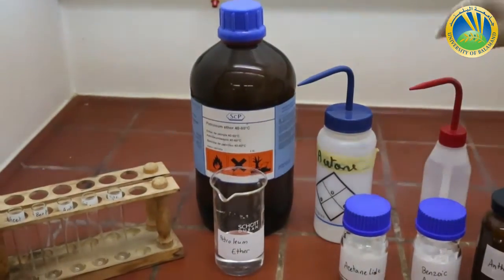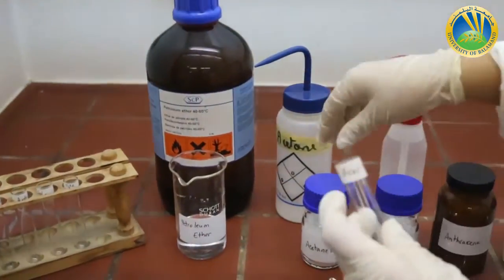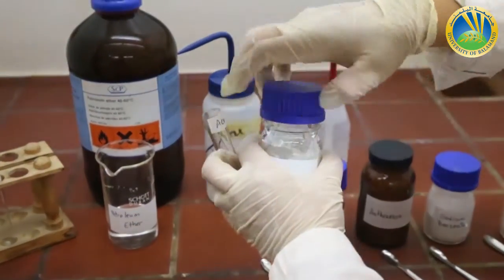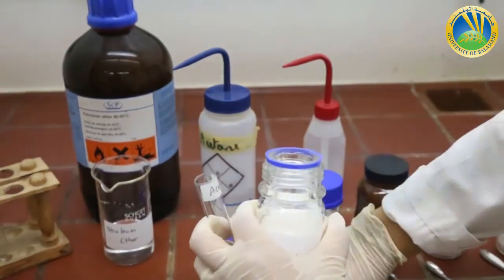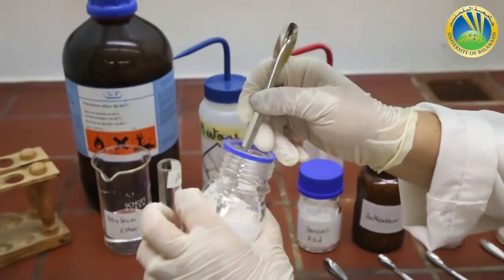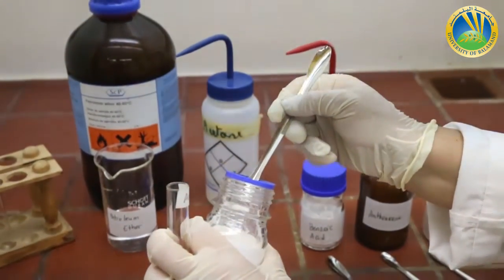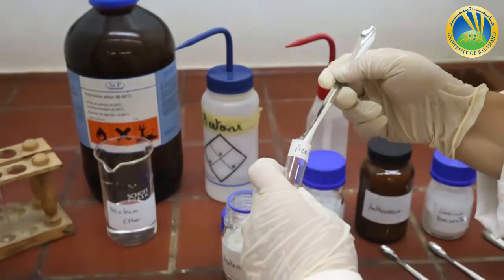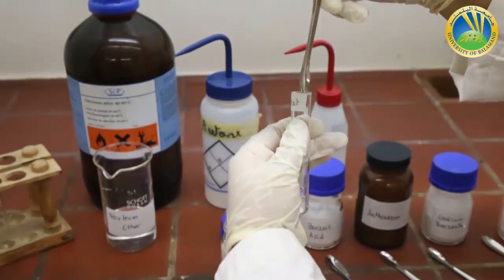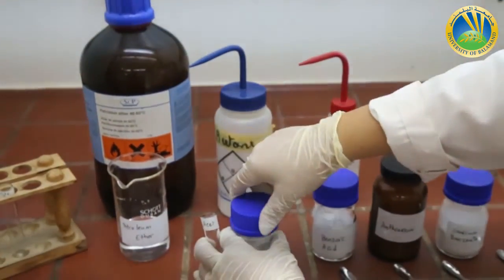To choose the adequate recrystallization solvent, we have to put a small amount of our chemical in a small amount of solvent.